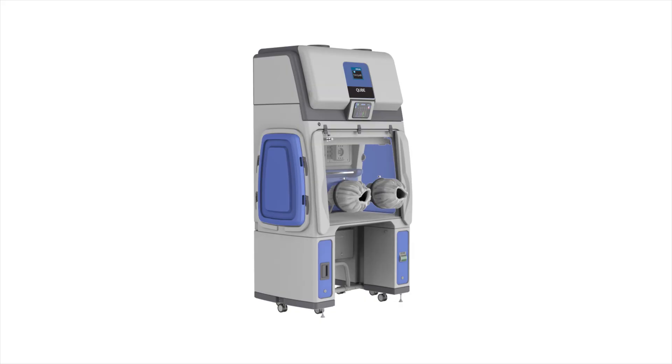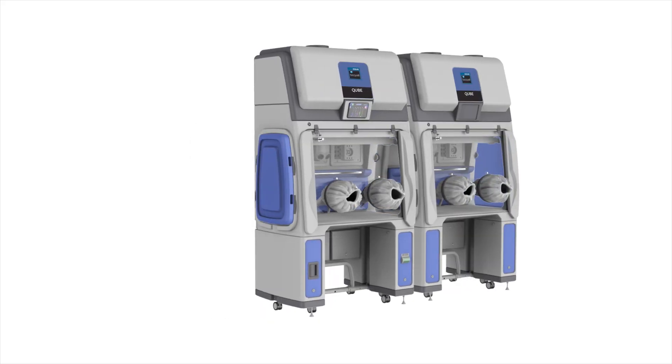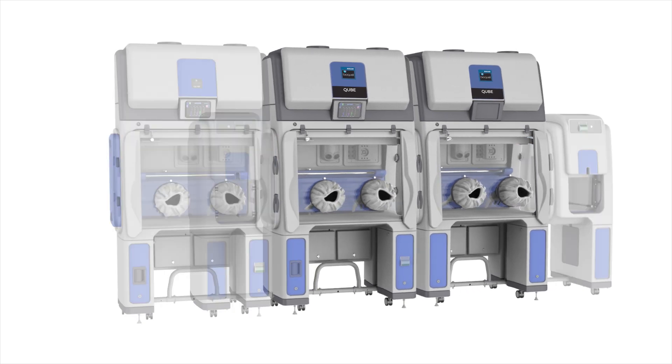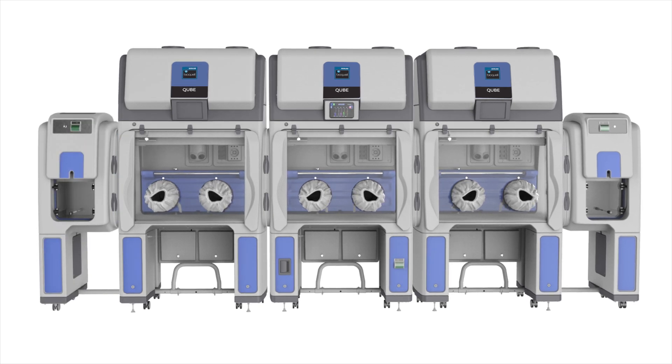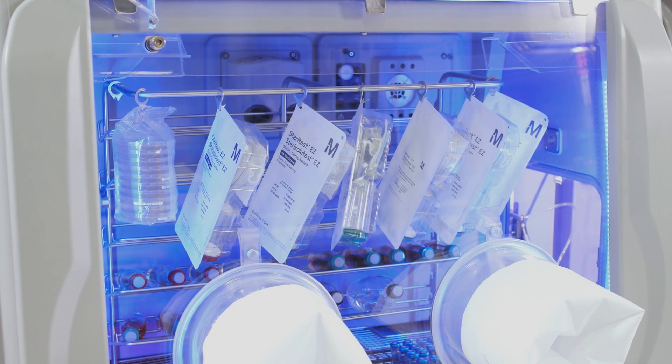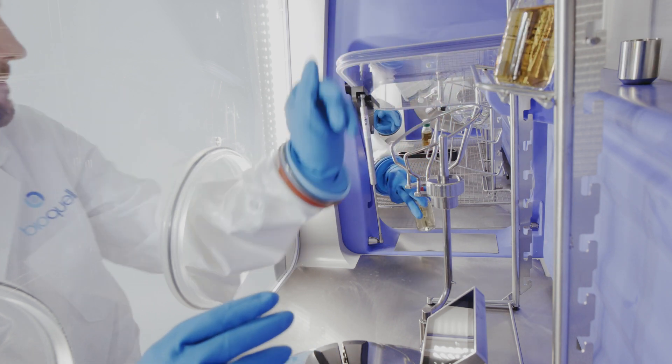Each BioQuell Cube can be tailored to your requirements now and at a later date. Its modular design allows you to add or change configurations as you need. Technicians enjoy working with the BioQuell Cube because it has been designed with their comfort as a core feature.